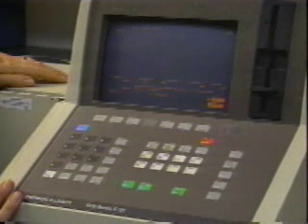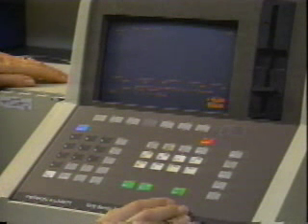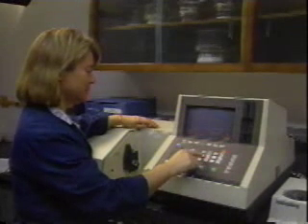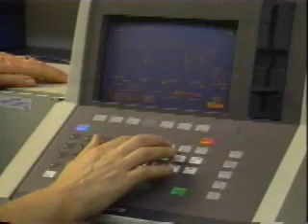A background spectrum is stored in the FTIR and is automatically subtracted from your sample spectrum. To view the current background stored in the instrument, press the background key on the keypad. This FTIR has three storage or buffer regions, arbitrarily labeled X, Y, and Z. If you press one of these letters on the touchpad, the spectrum stored in that region will appear on the screen. The FTIR can only store three separate spectra at one time. When you scan into one of these regions, you erase the spectrum that was previously stored in that region.